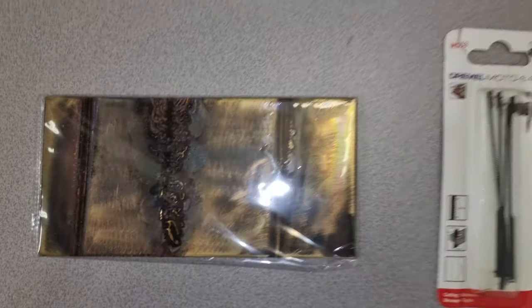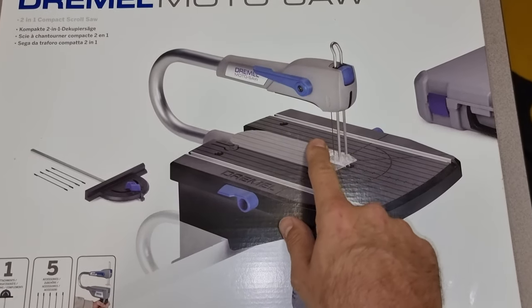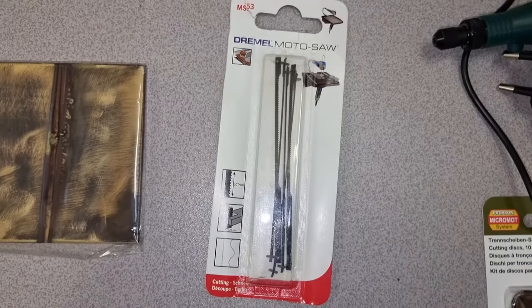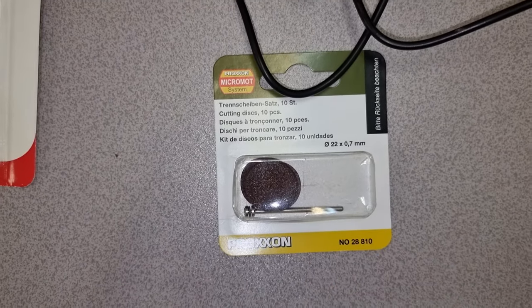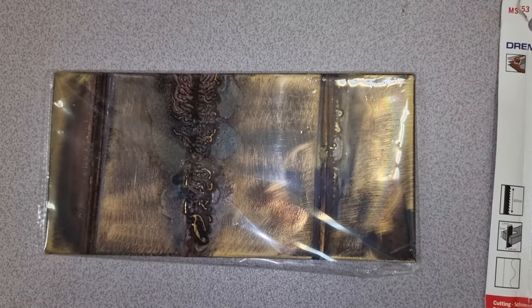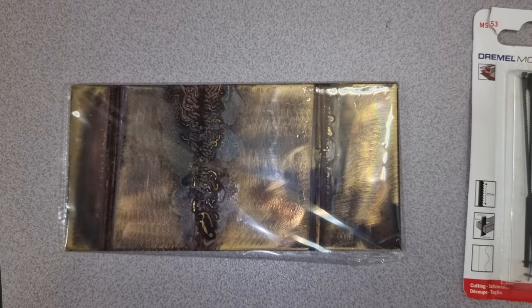I went out and bought this Dremel Moto saw and I'm hoping that this will do the job. There are a couple of blades for thin metal, and if that doesn't work, we also have a Dremel-like tool with some cutting blades and we'll have to mask off the area when we cut. The plan is to cut this and go test it tomorrow.